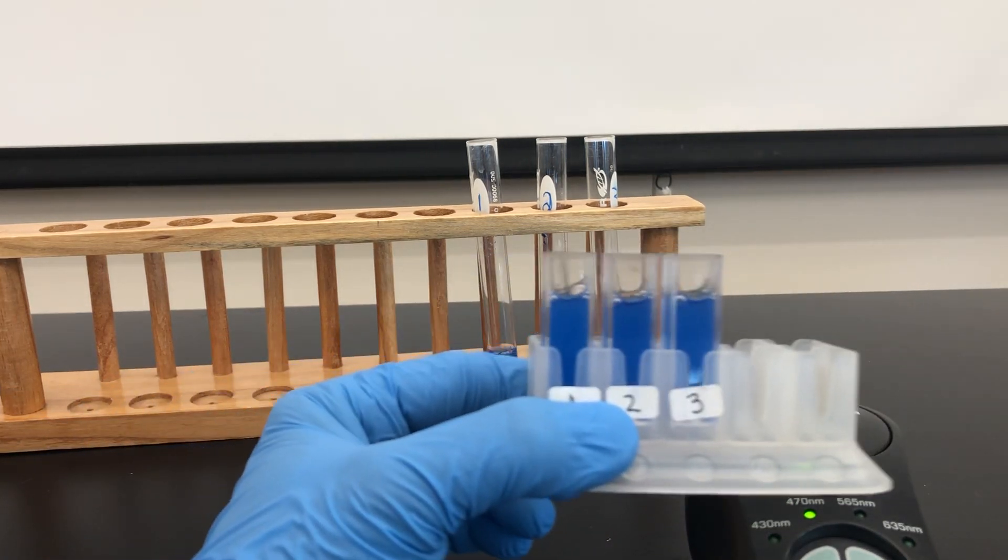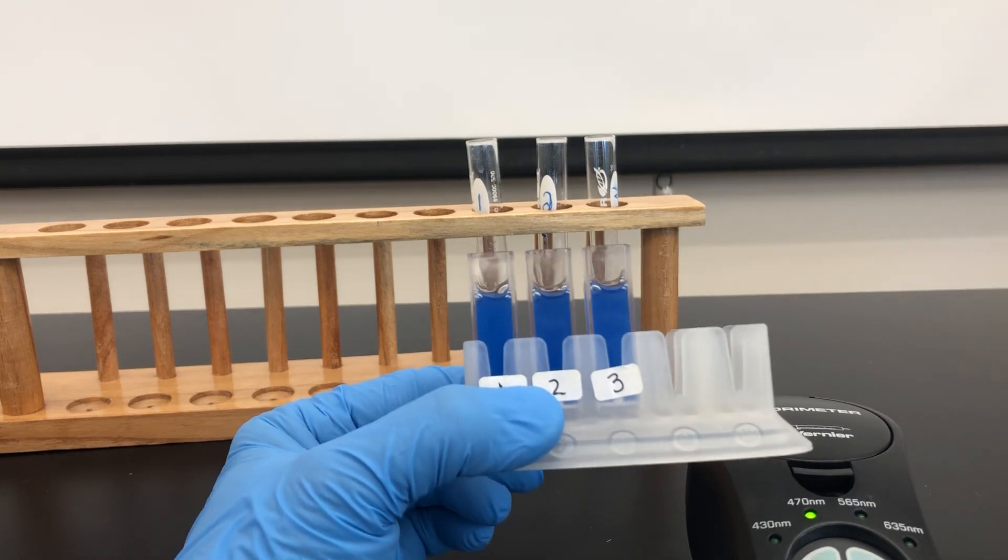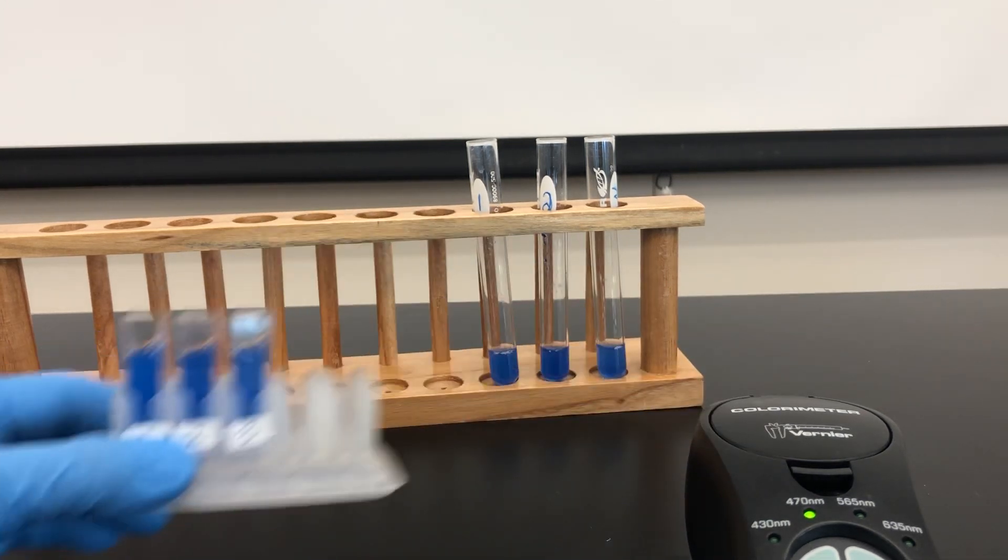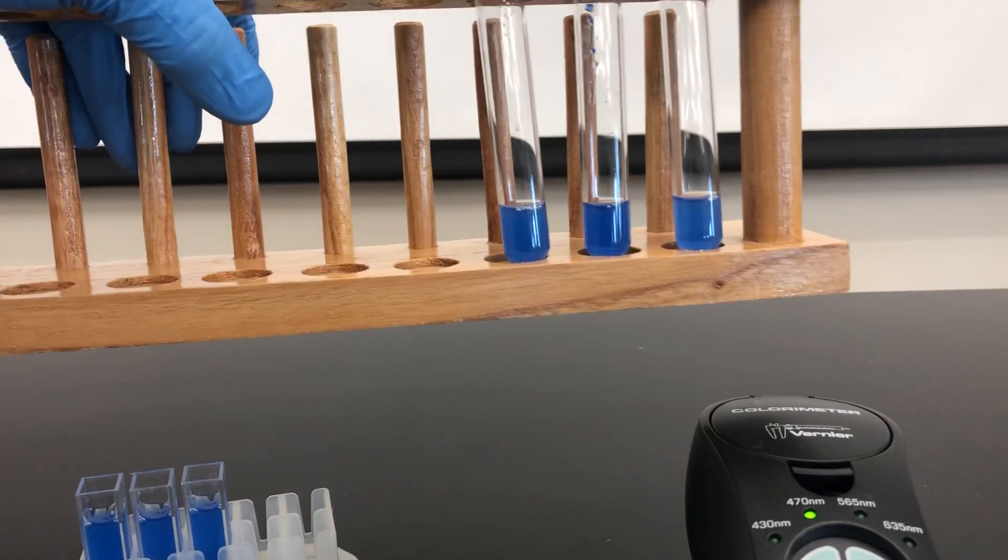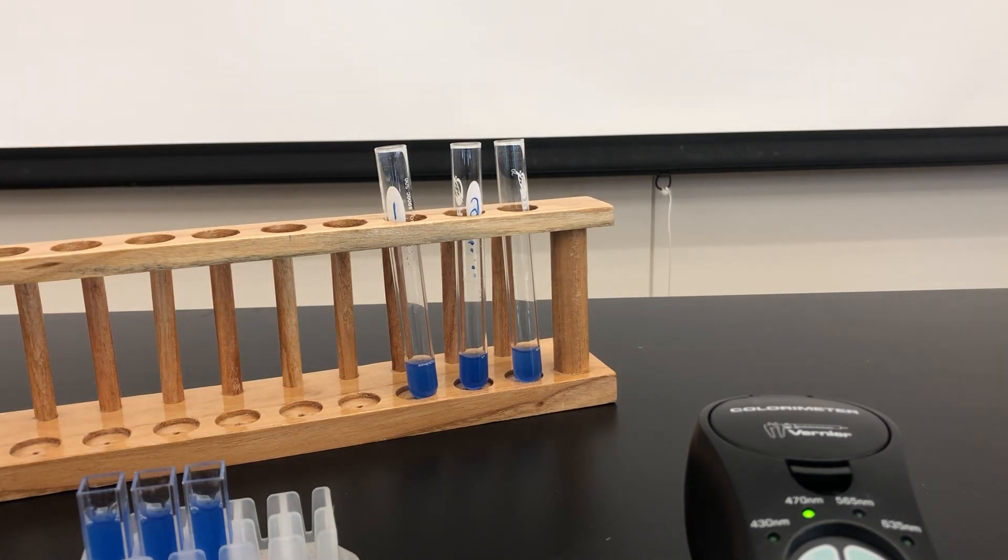I'm not sure if to your eye you can tell a discernible color difference between these three. Even in the test tubes, this is why we're using a colorimeter. It allows for a more analytical way to estimate the color spectrum. We'll be back in five minutes.